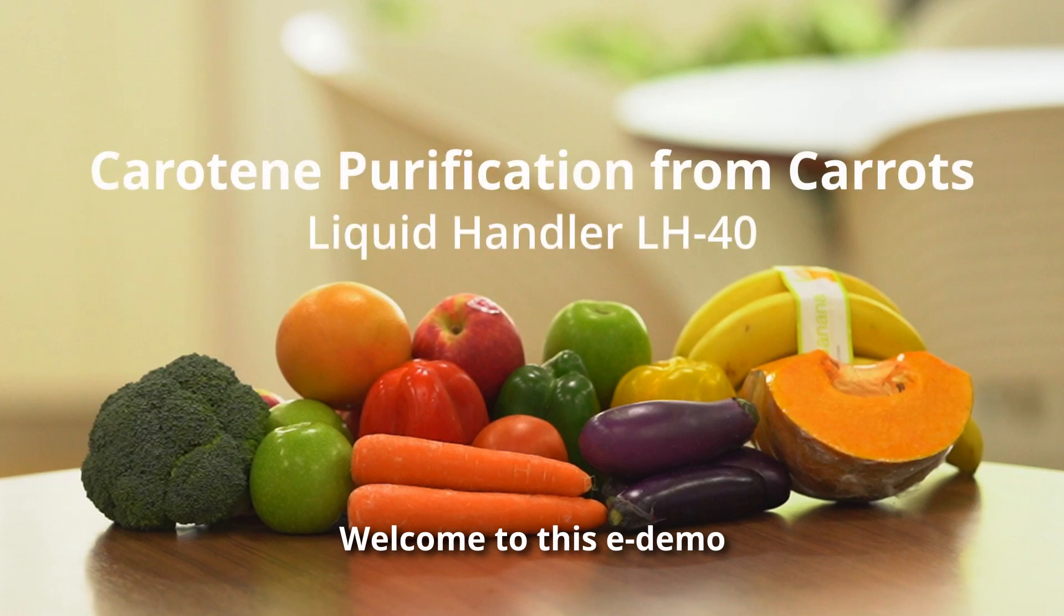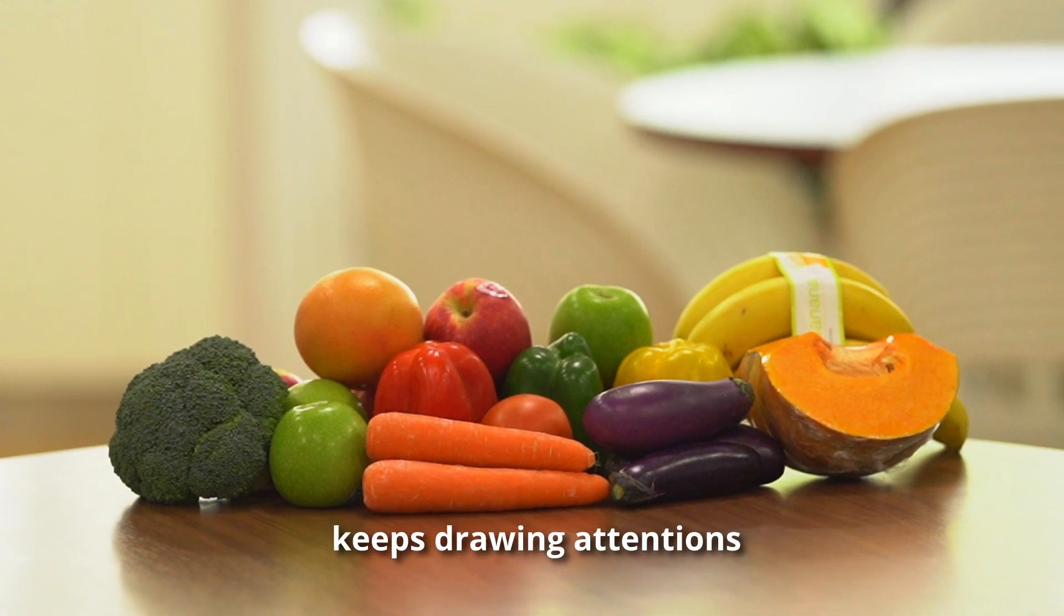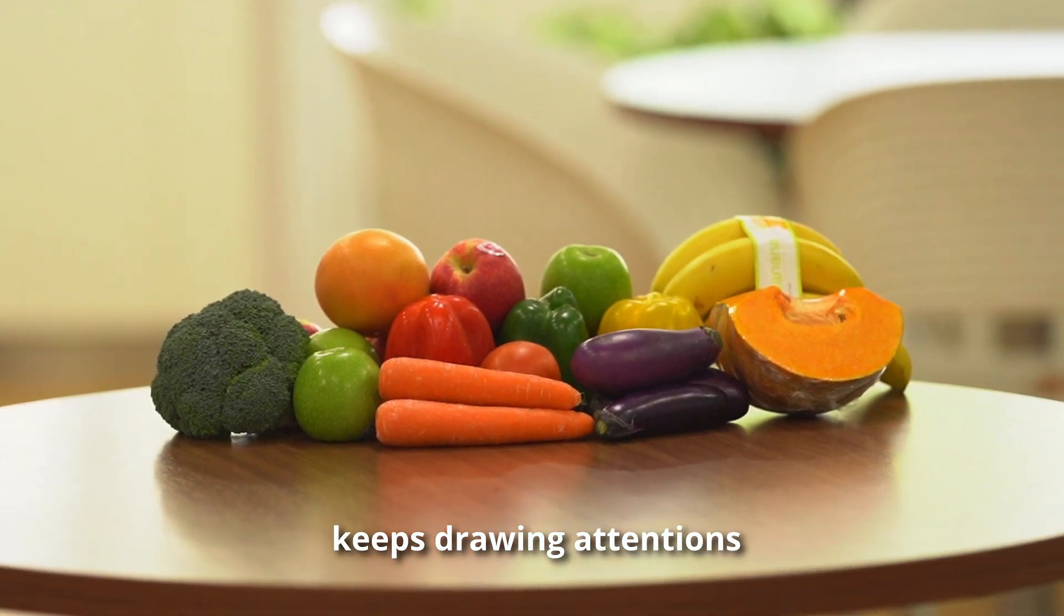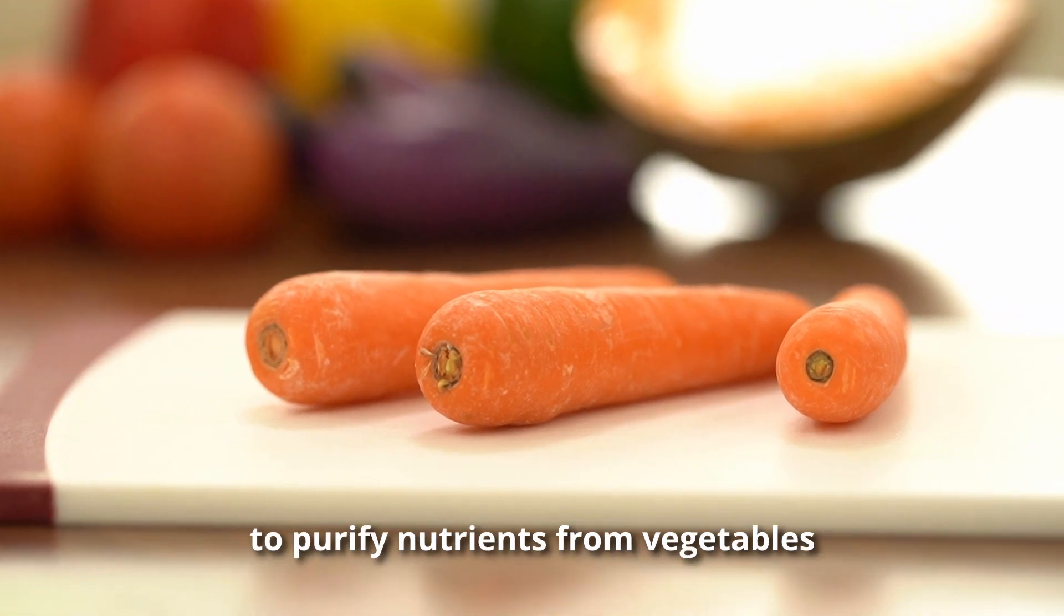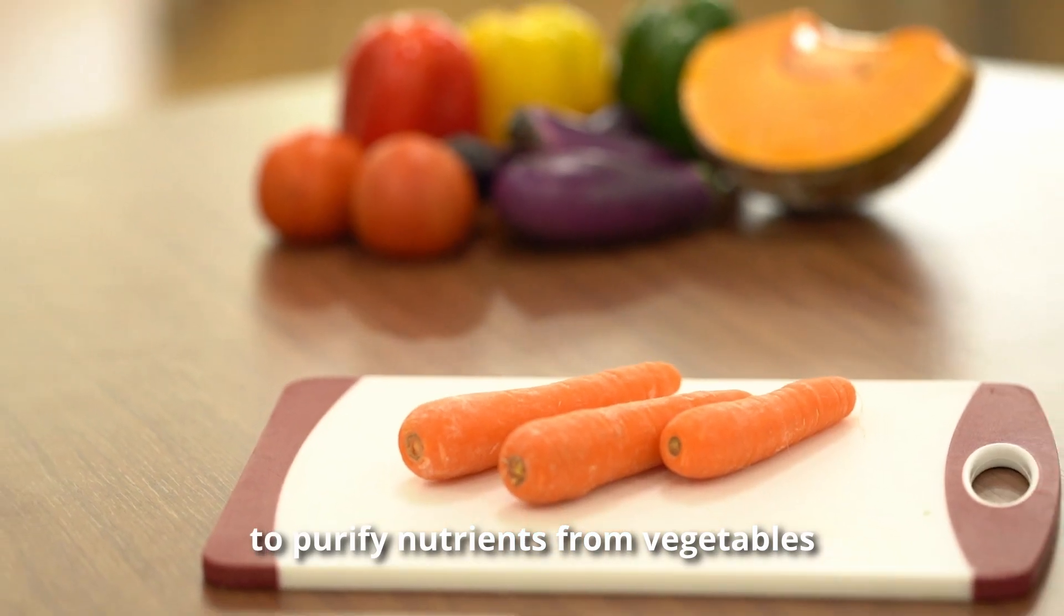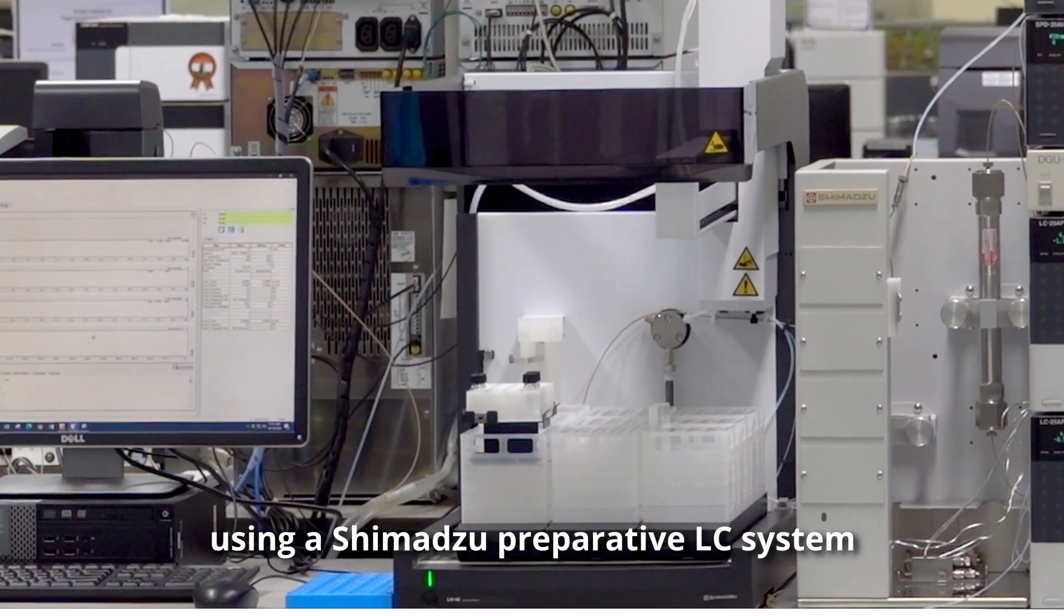Welcome to this e-demo. The purification of nutrients from vegetables keeps drawing attention. This e-demo will introduce you a simple way to purify nutrients from vegetables using a Shimadzu Preparative LC System.